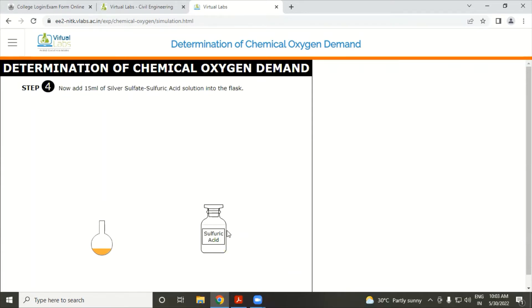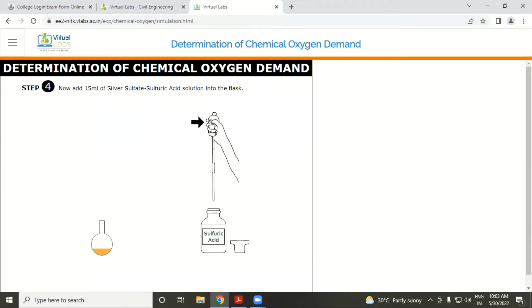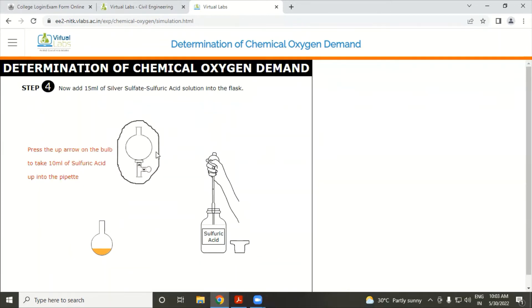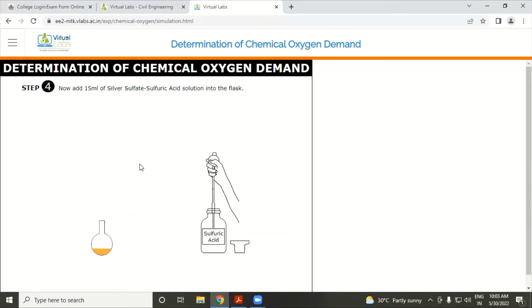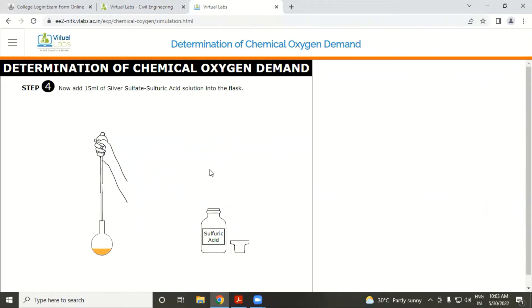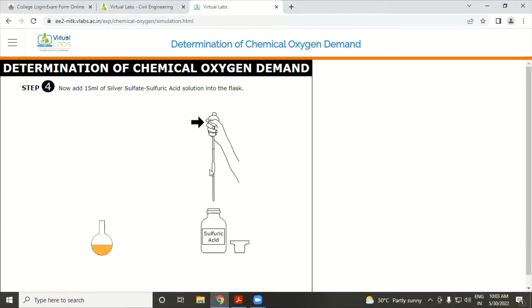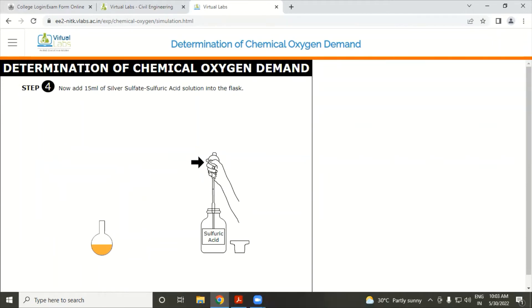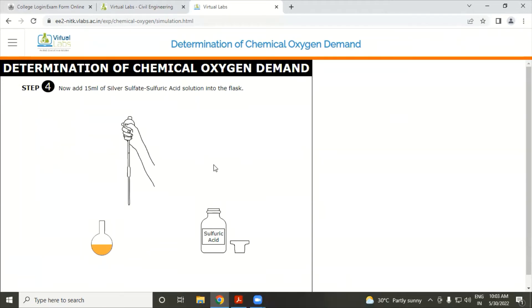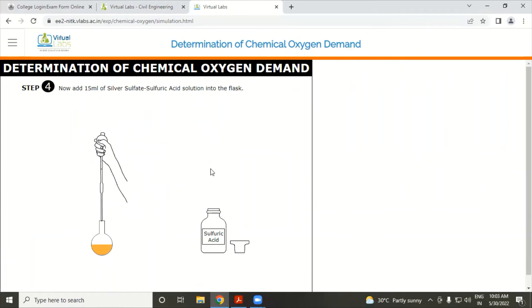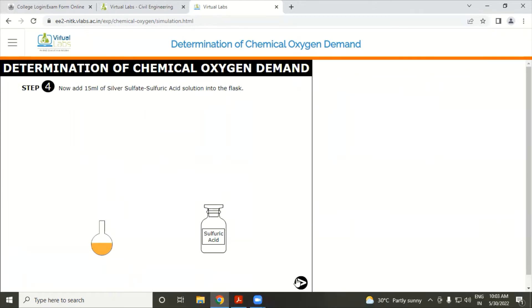Add 15 ml of silver sulfuric acid solution in the flask. Open the bottle cover and take 15 ml of solution. Then go to the next step.